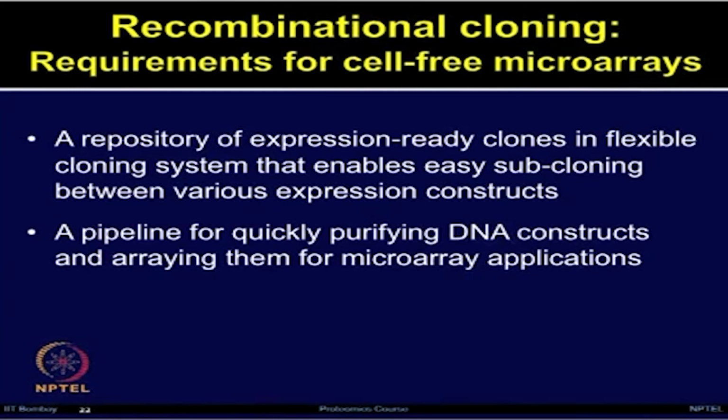In the subsequent lecture we will talk about cell-free expression systems, and even today we will touch upon the concepts of cell-free expression technology. But all this requires a large number of genes of interest, the cDNA clones, in the right expression vectors. By doing recombinational cloning, one has the flexibility to perform various types of applications, including microarray applications.